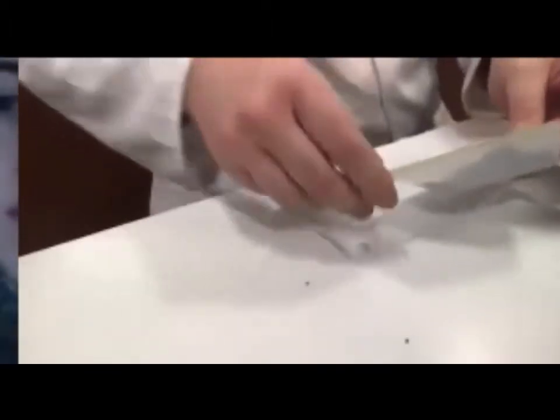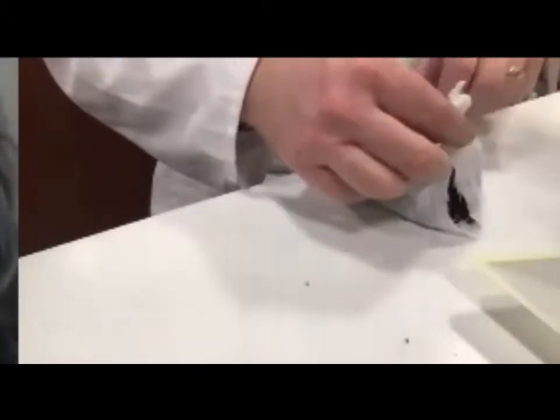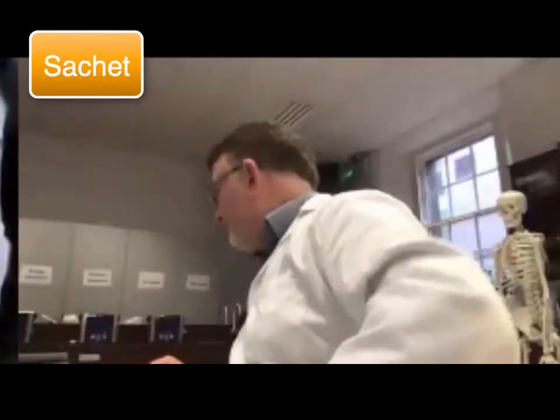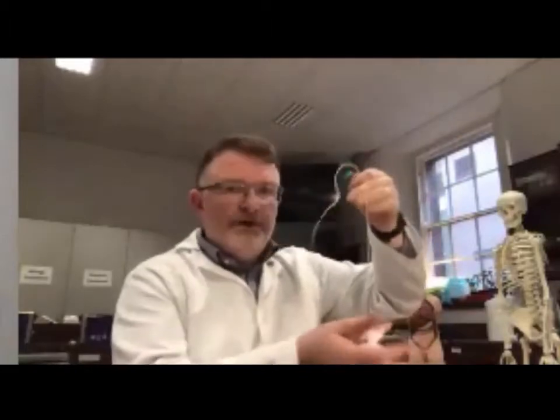Okay, so put that down again. So what we have, we'll put that on there. Okay, and we make a little sachet, as they might call it, a little thing. Did you see me tying that right? No, you probably didn't, sorry. I need two cameras. Okay, there we go. All right, 50 grams of soil, fresh enough soil.